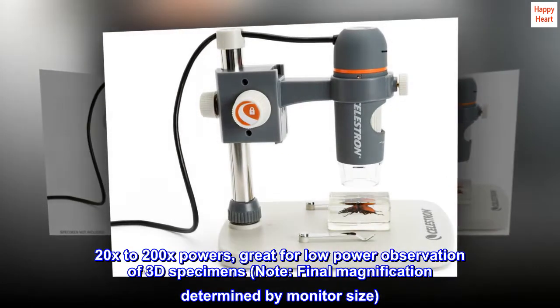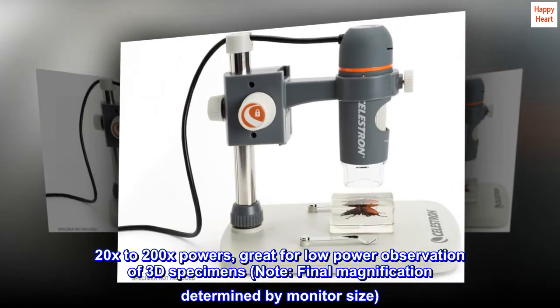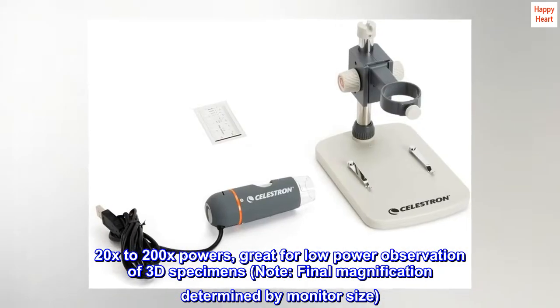20x to 200x powers, great for low-power observation of 3D specimens. Note: final magnification determined by monitor size.